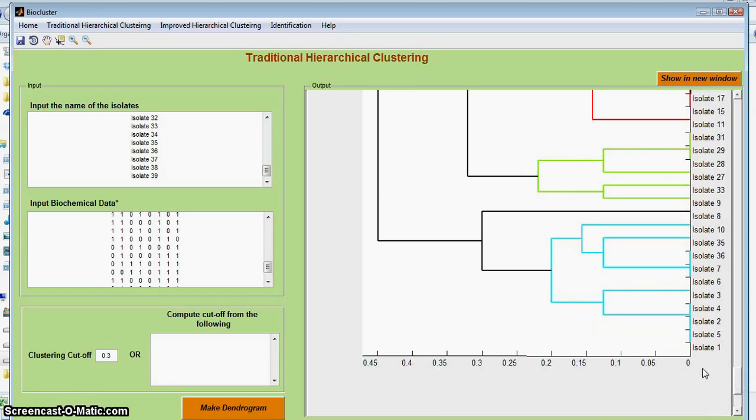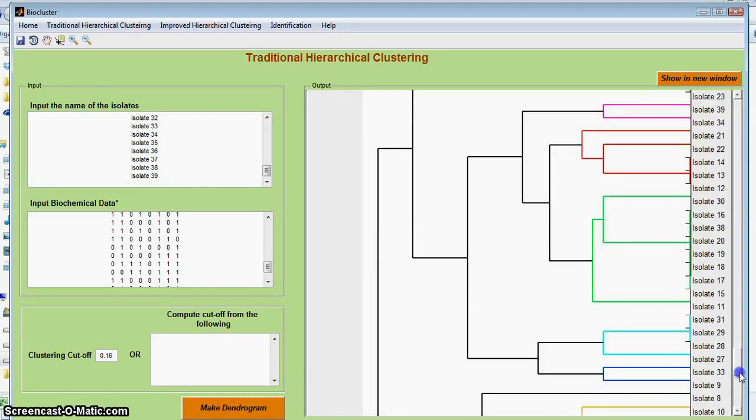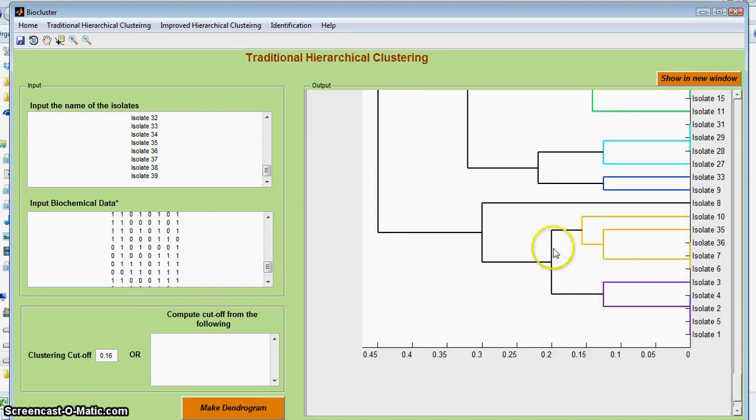Okay, so let's set it a bit lower. Let's set it here. If we set it here, then this color will also disappear because we're setting it to 0.16 perhaps. Let's have a look, and this will also break down into two pieces. Okay, I see the coloring is lowered. Yes, this was a whole single color, and it is split into two different colors now.